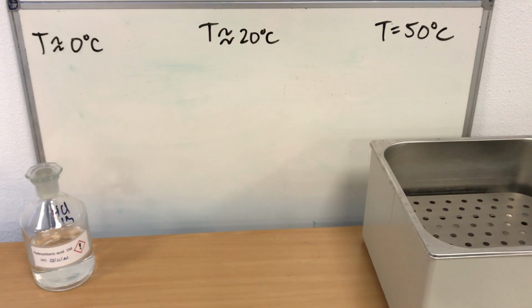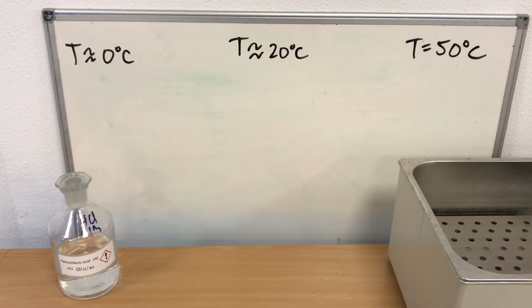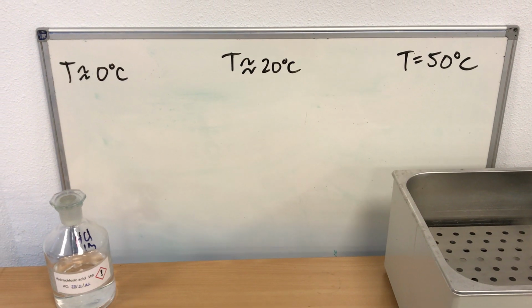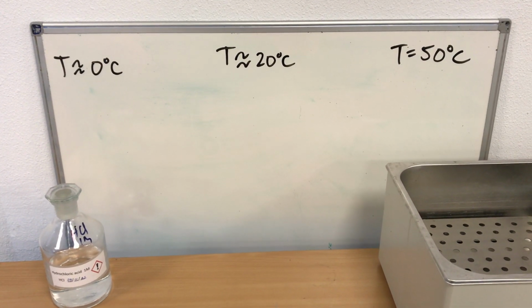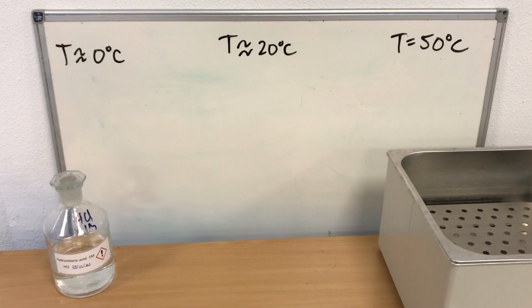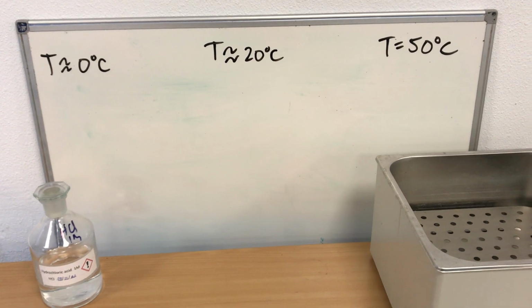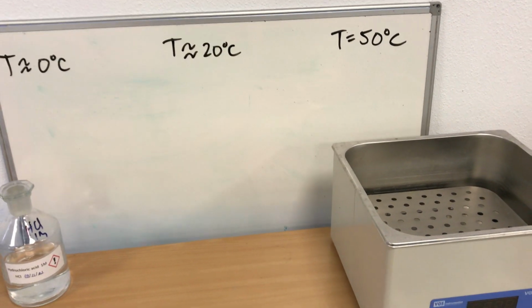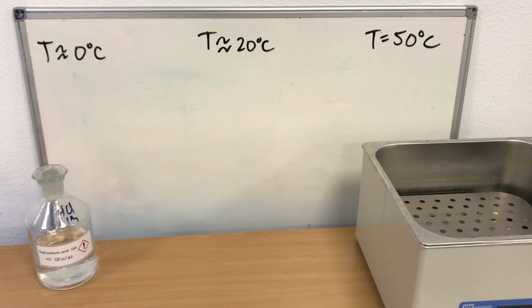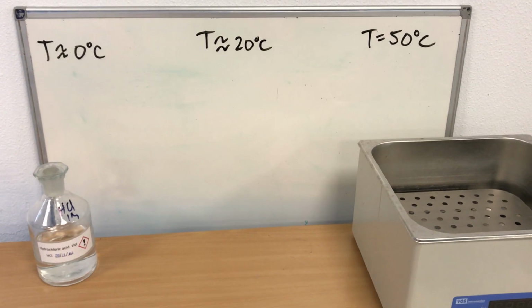You don't actually have to use any of these temperatures. You may find that it's challenging to use some of these temperatures, or you can try to use these 3 temperatures as 3 out of your 5 temperatures. But that's what will be prepared for you when you arrive in the room. You will have close to 0 degrees Celsius, you will have room temperature, and you will have hot, close to 50 degrees Celsius hydrochloric acid, and it will be up to you to test 5 different temperatures of hydrochloric acid to see how temperature affects the reaction rate.